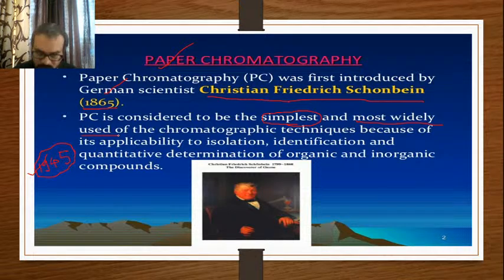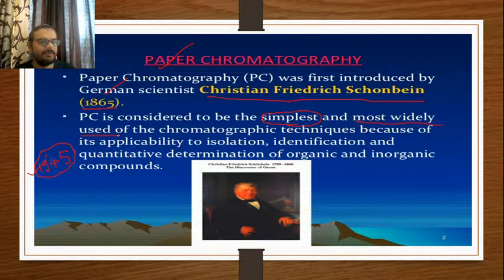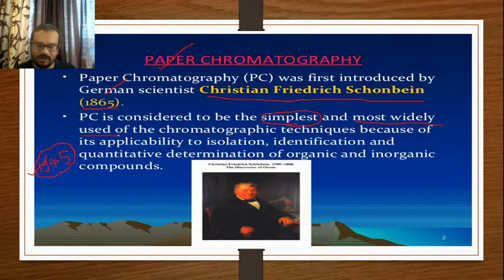If you have a small amount of sample, you can easily separate it by using paper chromatography. It is the simplest and most widely used chromatographic technique because of its applicability. Remember, the dimensions of applications in chromatography do not get limited because of its simplicity. What I mean to say is, whatever applications are there in HPLC can also be applicable in paper chromatography, starting from isolation and identification.